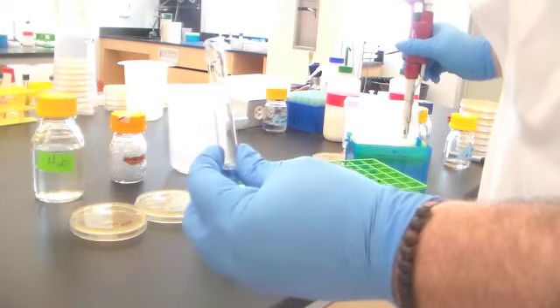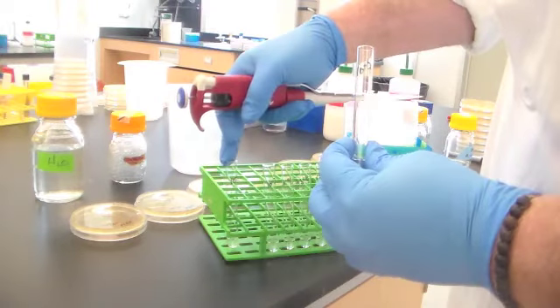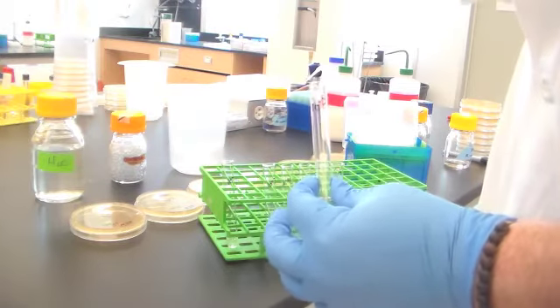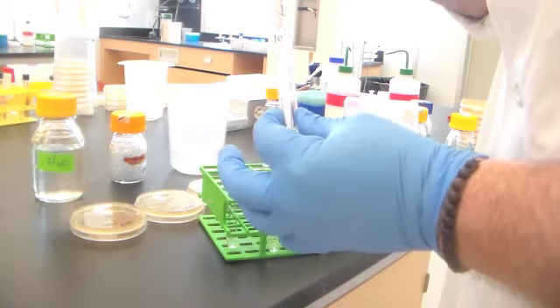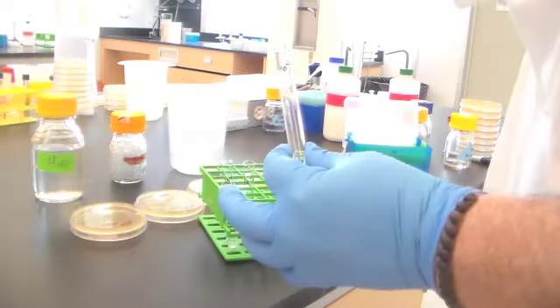So if there were 10 million bacteria in the original culture, there were 1 million per mil in the 10 to the minus 1. There are now 100,000 per mil in this culture. So now I'm going in with a new pipette. I'm going to pull out 100 microliters of my 10 to the minus 2, set that aside, put it into 10 to the minus 3.